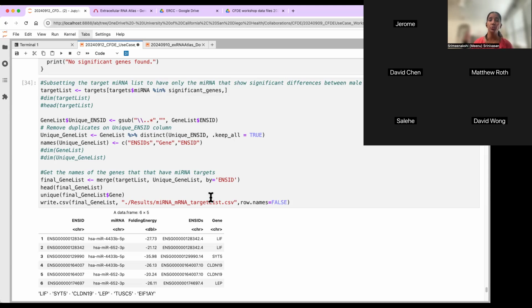You could also do something very similar with, if you know how to do single-cell RNA-seq, you could look for genes that are differentially expressed between male and female, and then go to the HuBMAP data coordination center, get the single-cell RNA-seq data, let's say from the heart, and see which of those individual cells contribute to those differences that were present in the bulk RNA-seq.